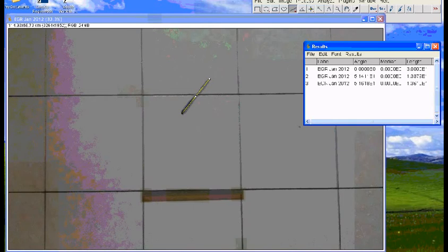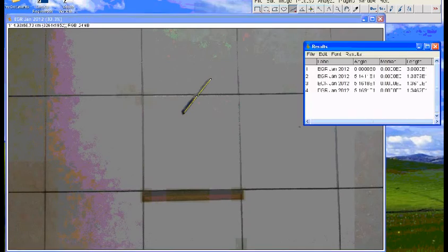So you want to make it more accurate, take a few more readings. Maybe start here, you don't overlay it, you start here, click, drag it, and stop somewhere here, release it, Control M again, 13.34, and then again, Control M, 13.34, 1, 2, 3, 4.